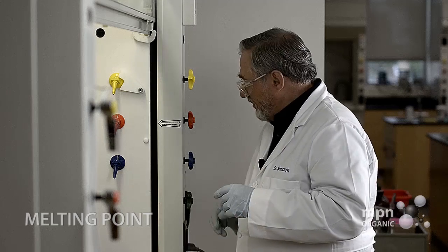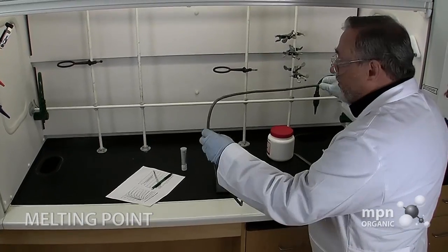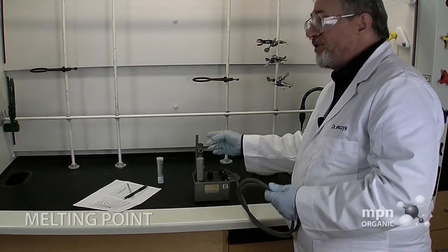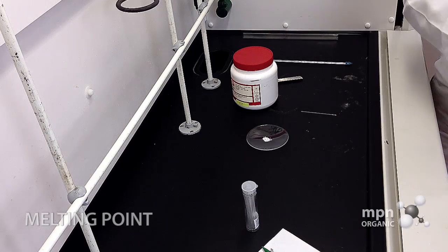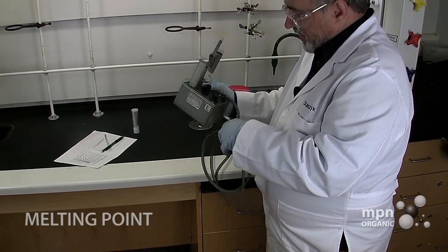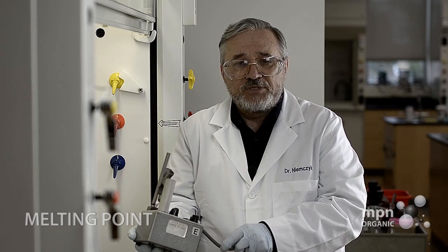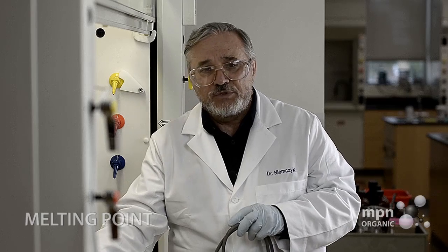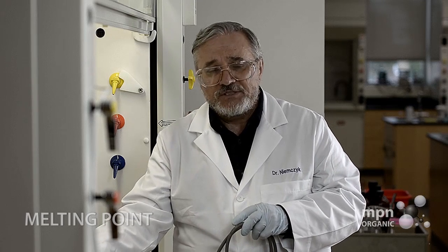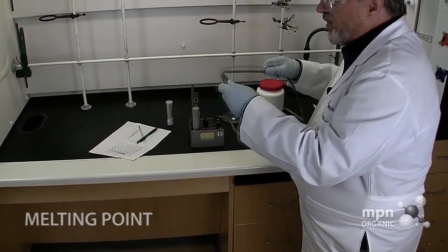And when we unplug the Mel-Temp, we don't take this cord and wrap it around, because a lot of times the cord touches this very hot aluminum block, and in fact it will melt the insulation off of the cord here. Now you can see that there is some deterioration here, which does not present any sort of problem, but which in fact should not have to be if you are vigilant and let these things cool down. And they cool down reasonably fast, and then put them away, trying not to wrap the cord around it.